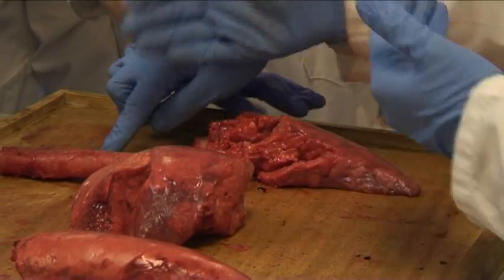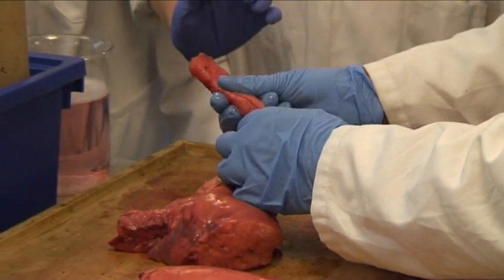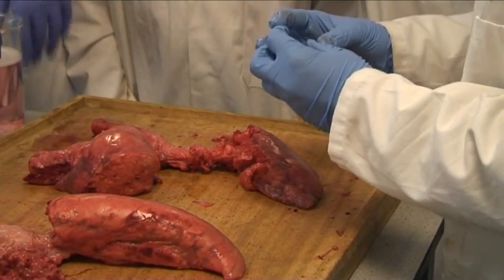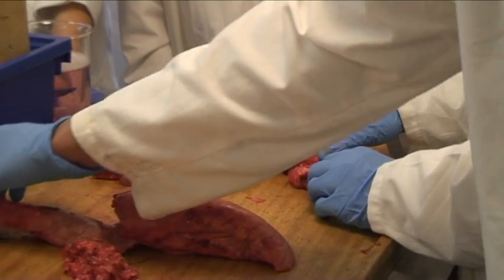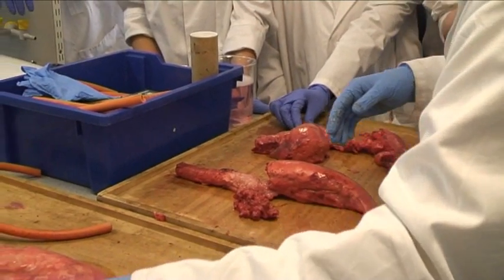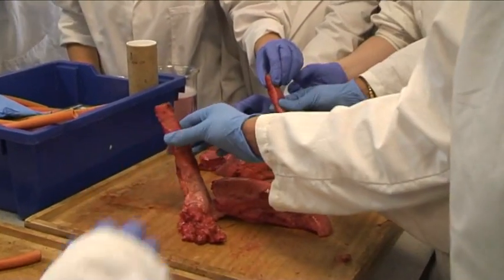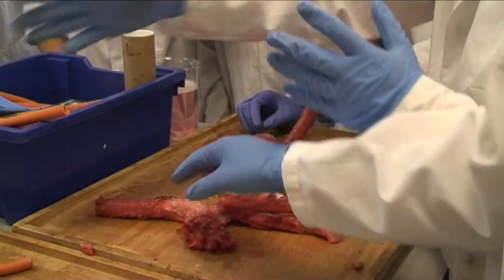At the end of the bronchioles we have tiny, tiny air sacs known as alveoli, and that is where gas exchange is taking place. Trachea splits into bronchus, bronchioles are the smaller ones, and at the end of the bronchioles the tiny air sacs — alveoli — allowing gas exchange. That part there looks like it's part of the heart that they've taken off; the heart was situated there.